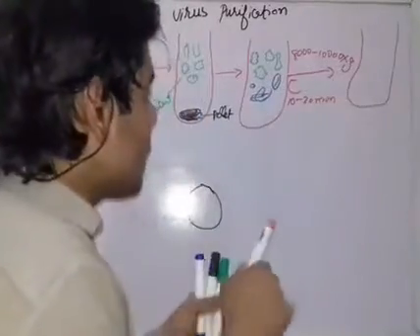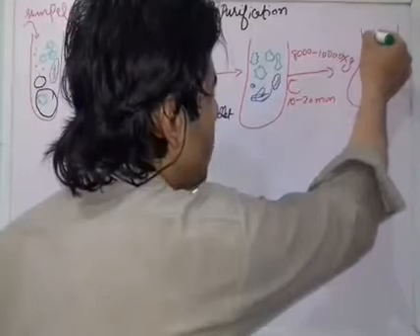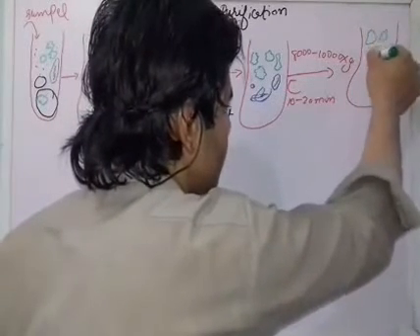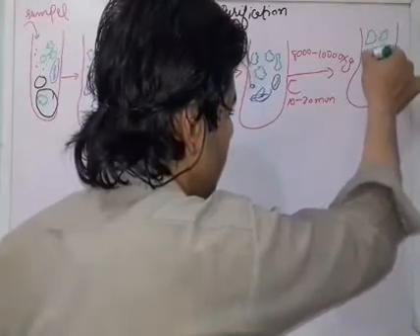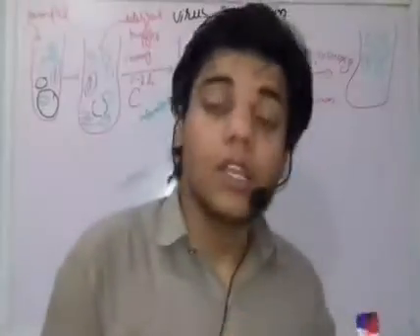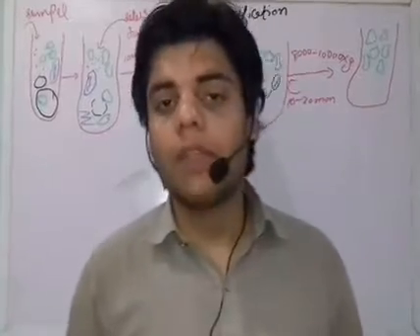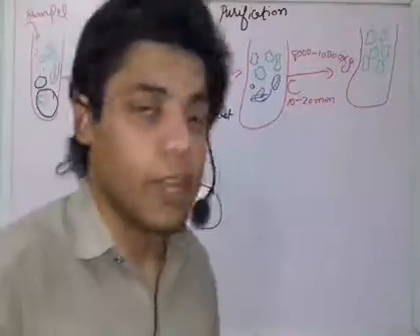We get the supernatant once again, but within this supernatant there are the active viruses present. Not only active viruses, inactive viruses, meaning incomplete viruses, are also present within this supernatant.